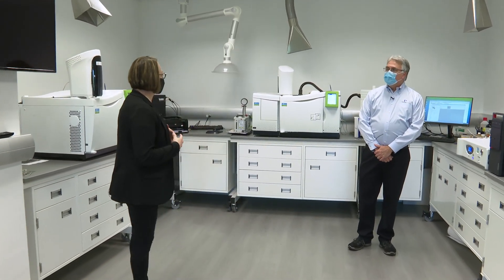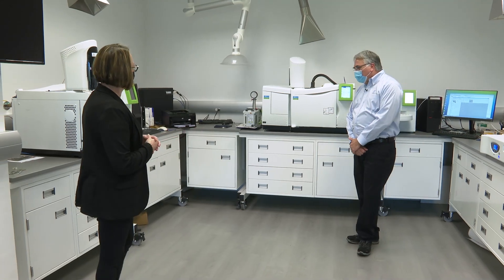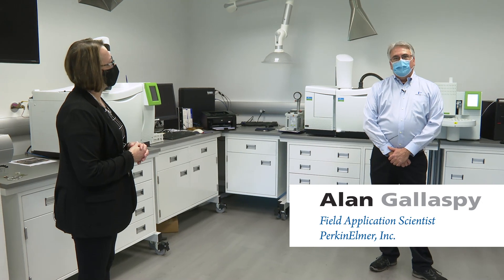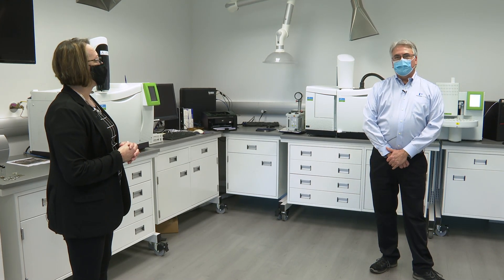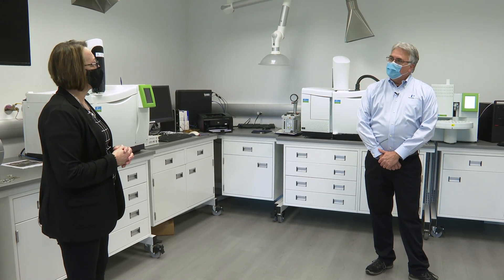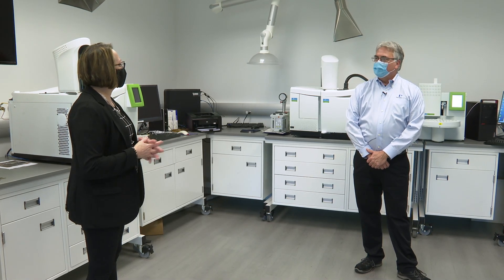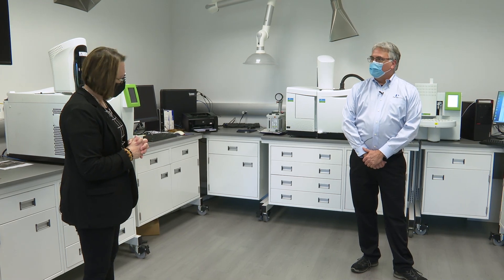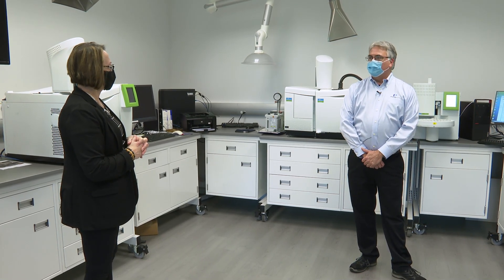Can you tell us a little bit about the GC systems that we have in the lab? So PerkinElmer has a full line of GC products. We have a couple of GC models — our standard model, which is a real workhorse and competitively priced, and our high-end model as well, which has super fast cooldown. The Claris 590 is the workhorse, and the Claris 690 is the fast-cooling one that you want for production work.